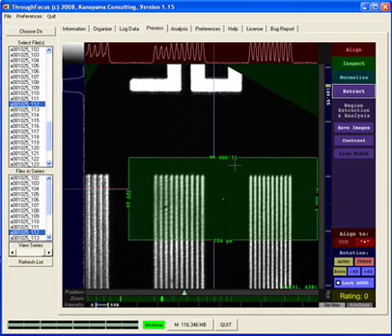So that's the basics for extracting your data, and that's probably what you'll need for doing these tiny defects in the bright field. The features for line edge measurements and sizes are still being developed, so those should be ready in a couple weeks. Anyway, I'm going to quit now and I'll talk to you tomorrow.